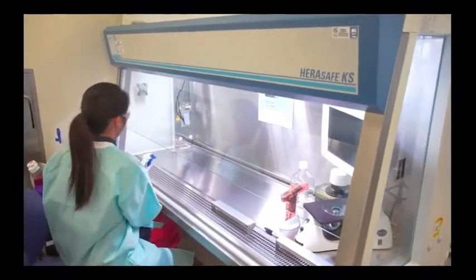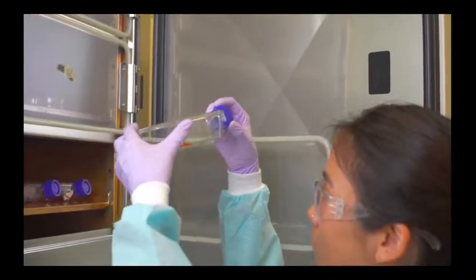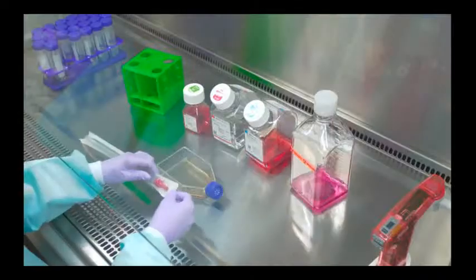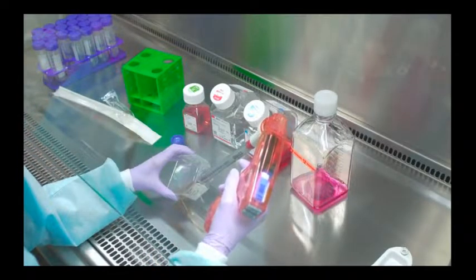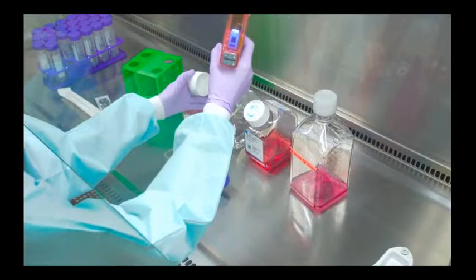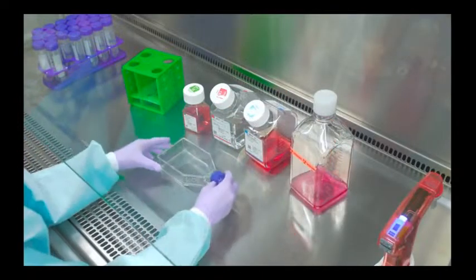Before retrieving your flasks from the incubator, sterilize the hood and have all required supplies at hand. Examine your culture carefully for signs of contamination or deterioration. Handle the cells with care during transport. For adherent cells, remove the spent medium from the flask using a sterile pipette. Rinse the cells with a balanced salt solution, such as DPBS. Make sure to use a salt solution without calcium and magnesium, as these may inhibit your cell dissociation reagent.